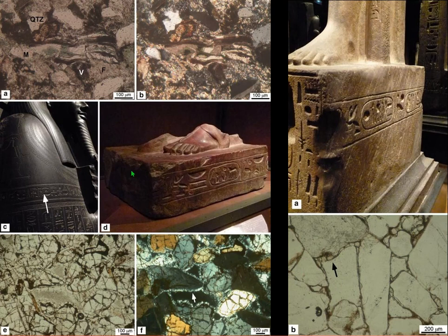And of course, there's lots of work being done on thin sectioning all these sandstones to try and differentiate between sources in Egypt.